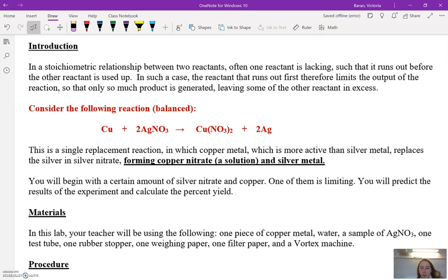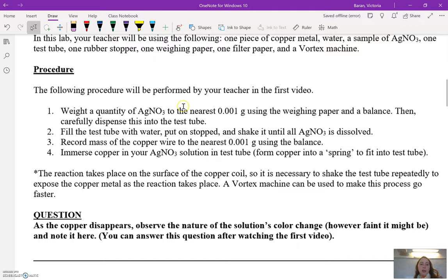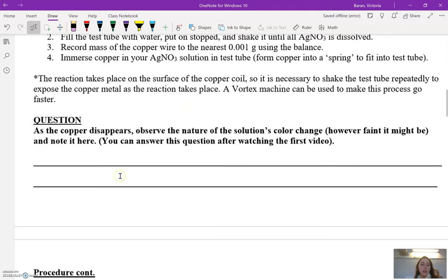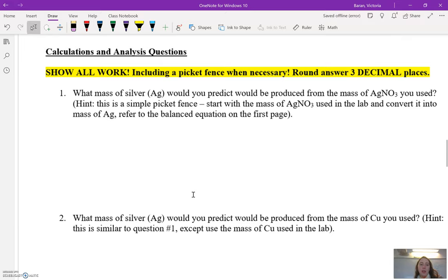I'm going to begin with a certain amount of silver nitrate and a certain amount of copper — I'll provide that information to you. One of them is limiting and you're going to figure out which one. You'll also figure out the percent yield of the product. I'm going to walk you through the procedure here. Because I have to let this dry overnight, the second video will give you the rest of the data from the following day, along with all the calculations.